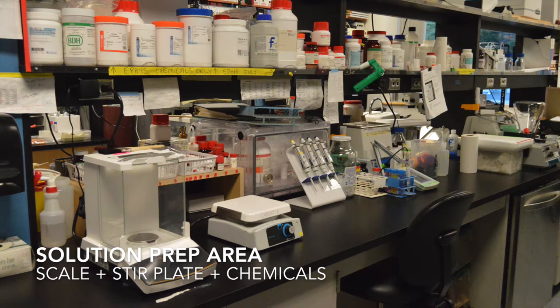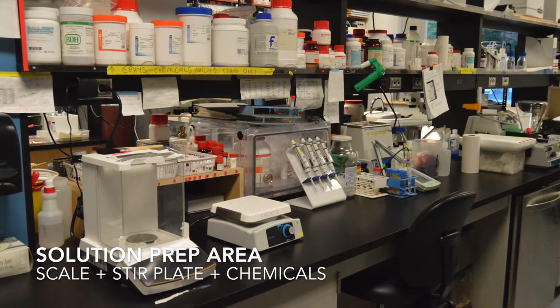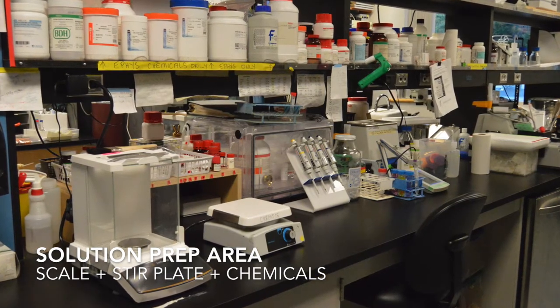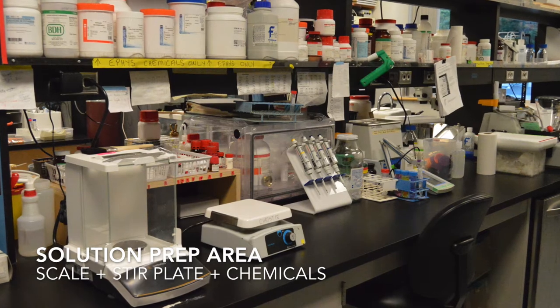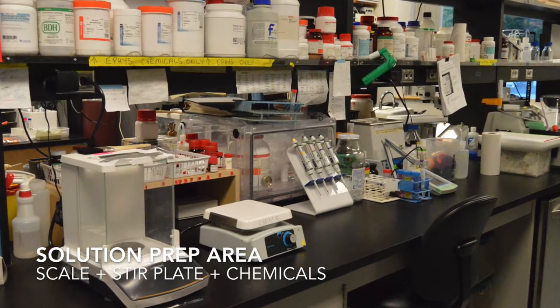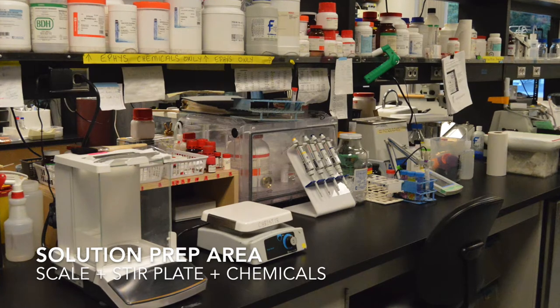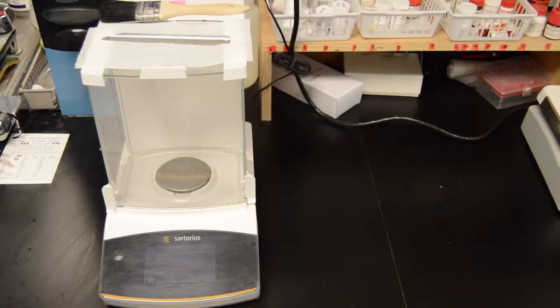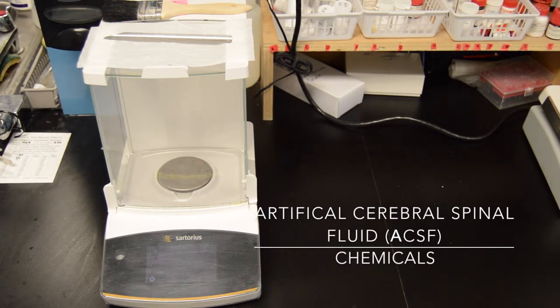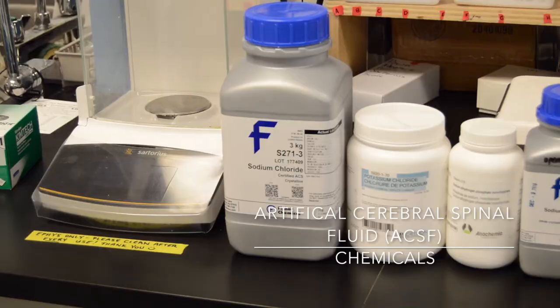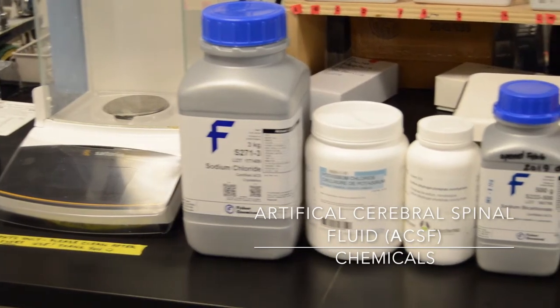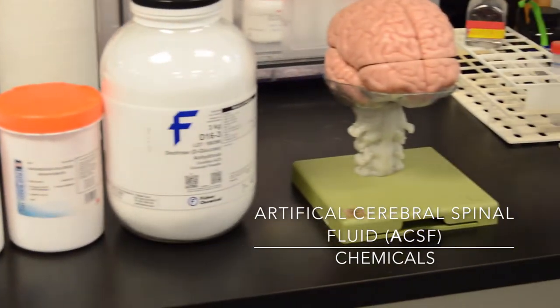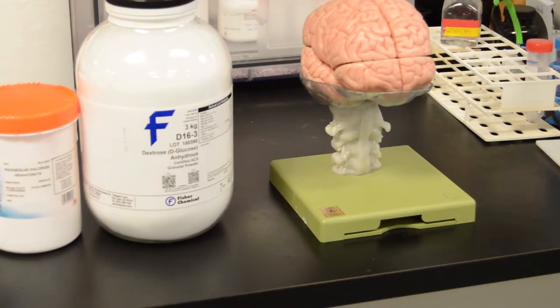The first step in any electrophysiological experiment is the solution prep. In our laboratory, we have a designated electrophysiology aisle where you will find all of the components required, including a scale, a stir plate, and all of the chemicals. Here, we will prepare different solutions that will be used through the entirety of the experiment. The first two solutions we will make are regular artificial cerebrospinal fluid, or ACSF for short, and also sucrose ACSF.